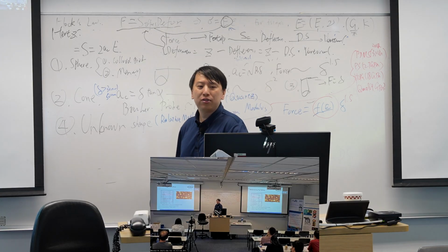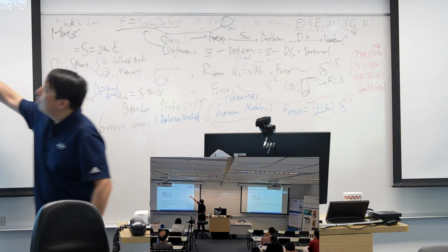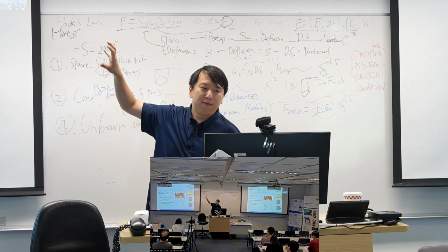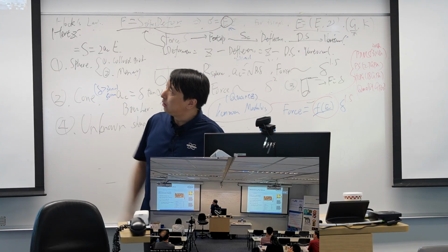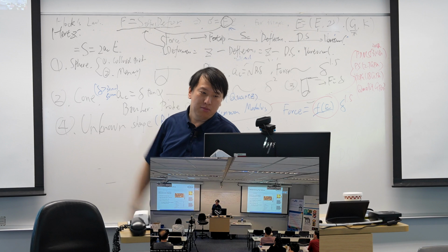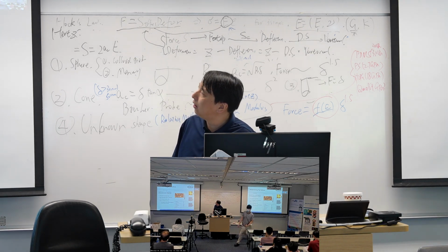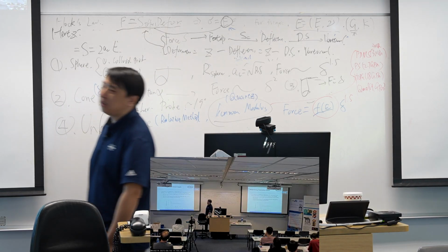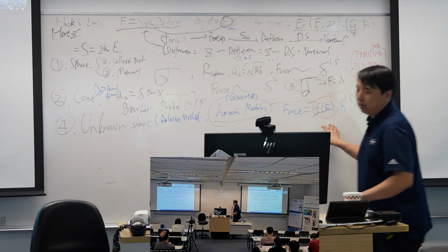They just use a sample to get the geometry of our probe, and from that geometry, they simulate the tip radius out from this shape, and that's the so-called absolute method. But to me, it's not that accurate. We prefer the relative method.